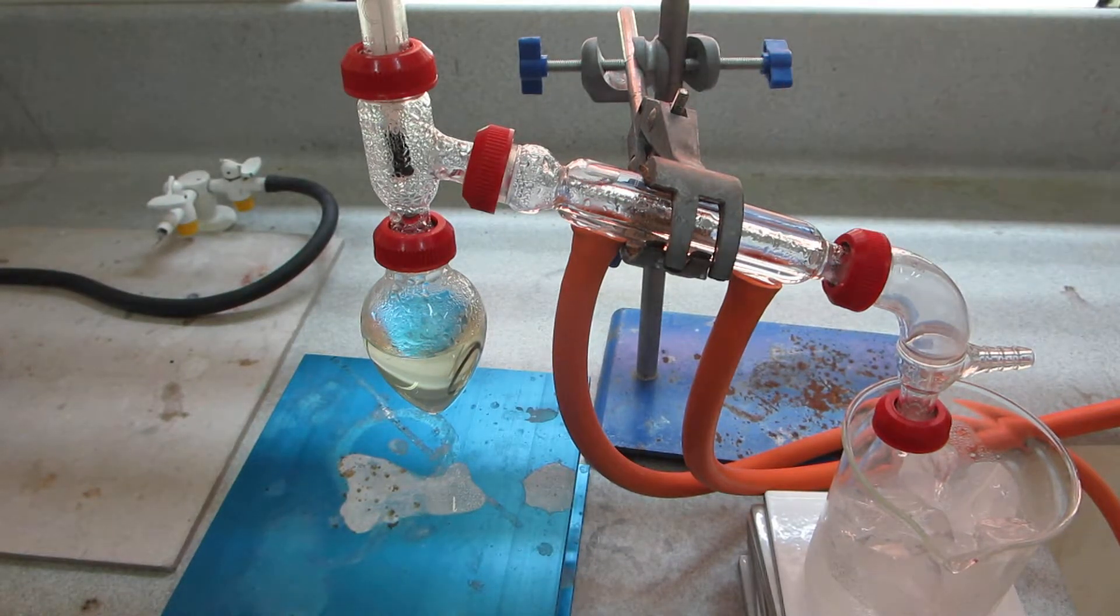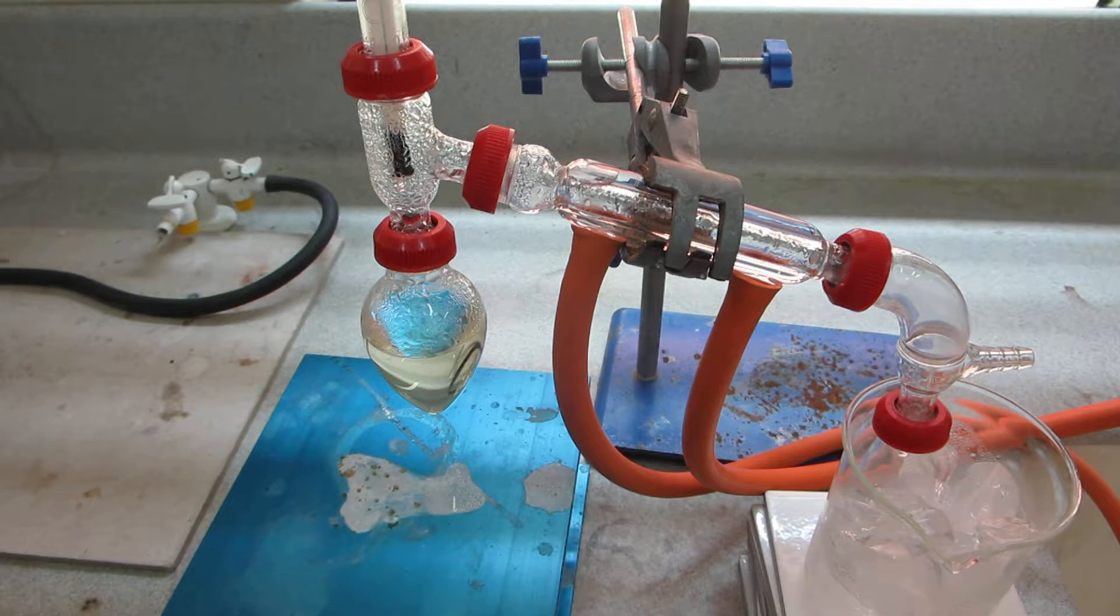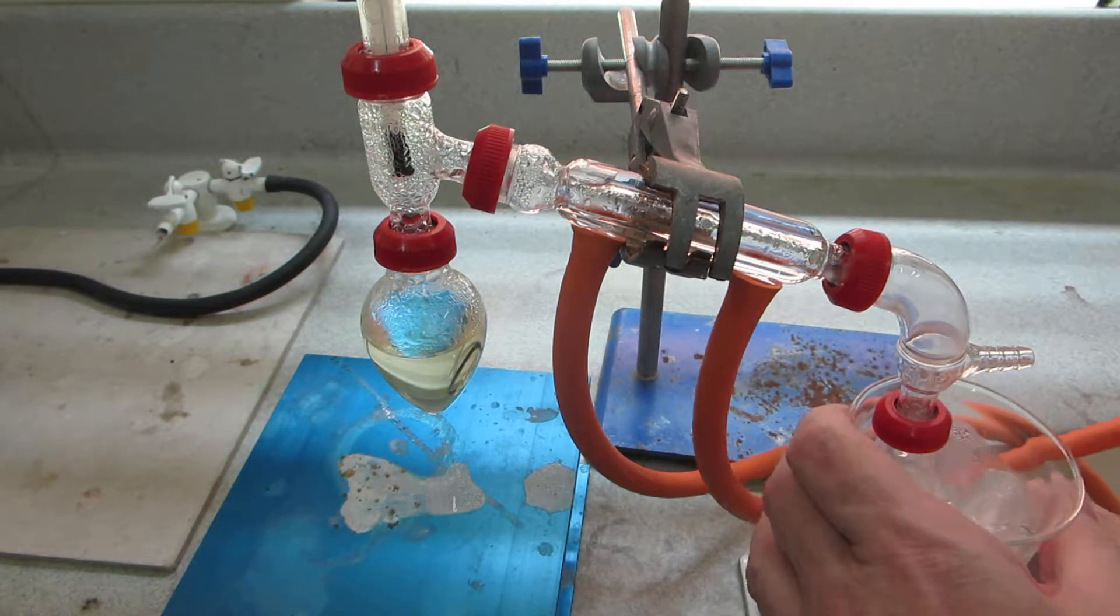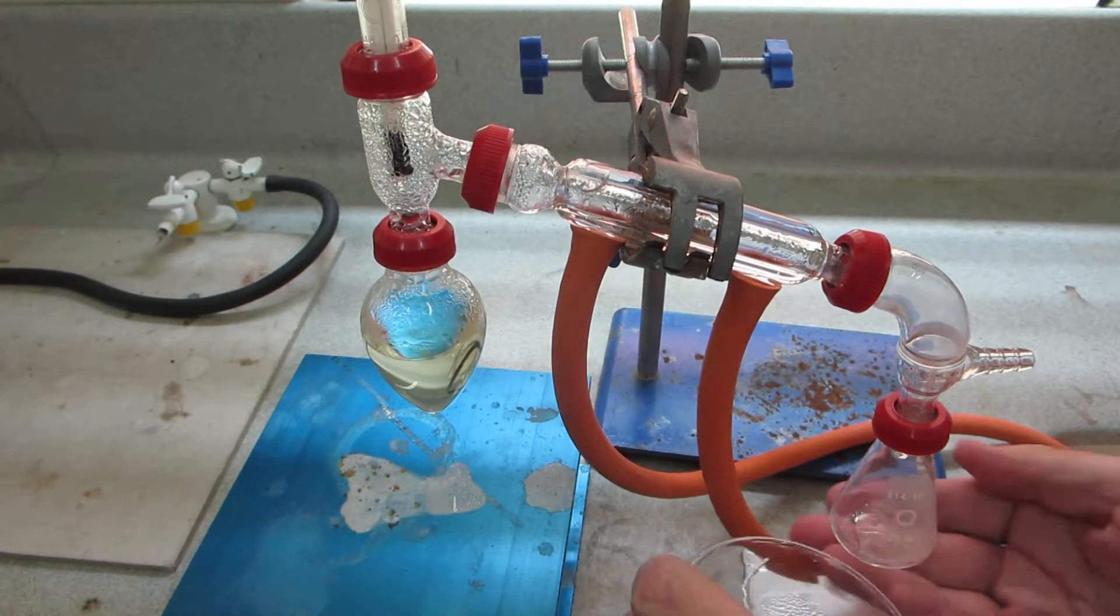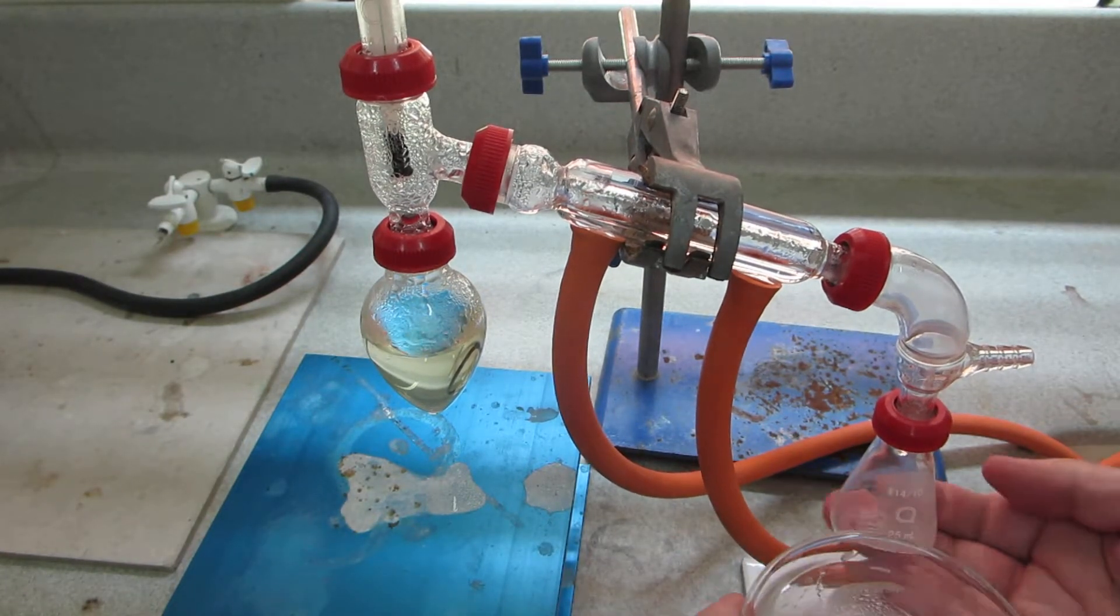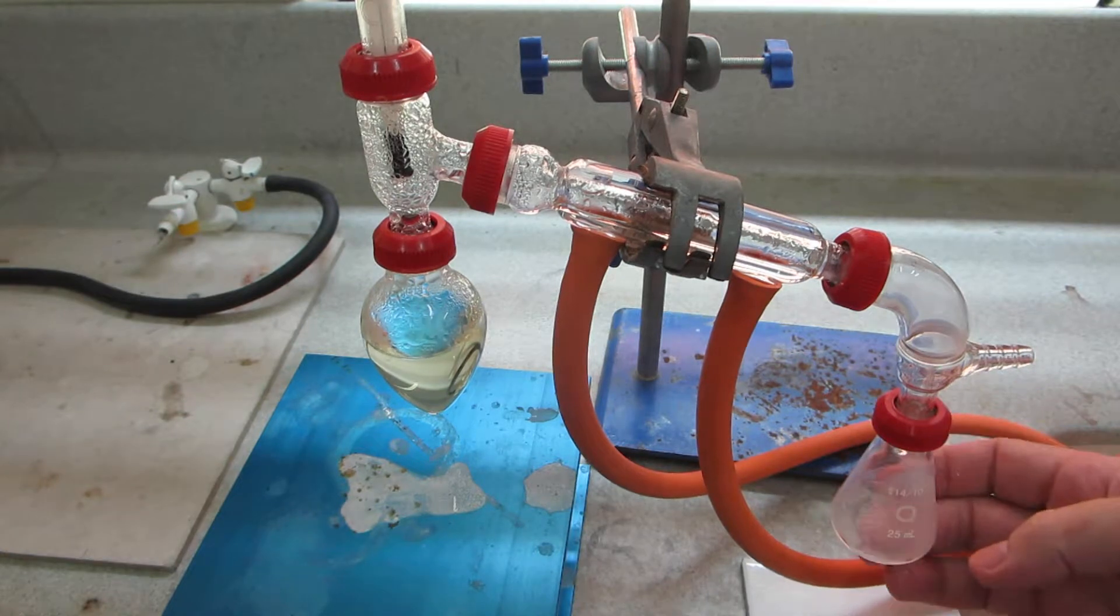We've given our system a good 20-30 minutes to cool down and now have a look at how much product we've got on the first take. In the flask here you might be able to see there's about half a mil of product, but there's a considerable volume of liquid condensed on the flask over here.